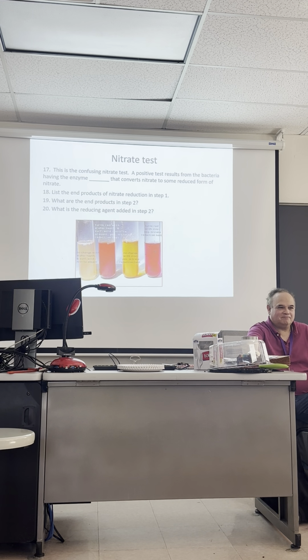Okay? Good? Yes? I was talking to the lab mates, but if we put in the first acid, I forget what it's called, sulfanilic acid, and there's a slight color change, like it turns more orange, that doesn't indicate anything. And you've not done anything else? I don't see how that would happen. We had a color change at one point, it was like a peachish color, went from yellow to peachish.